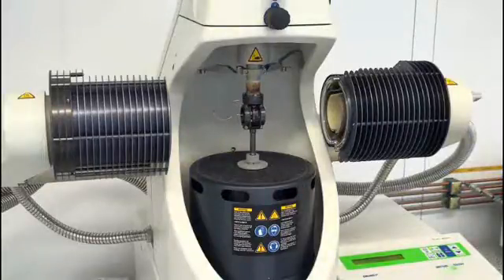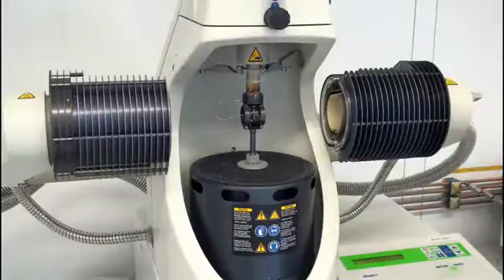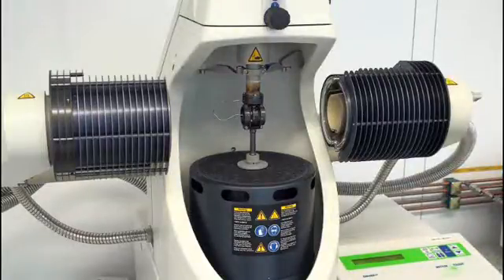But this is not all. Not only can we open the furnace to access the clamping assembly, but the whole design is dedicated to ease of use. There is a story behind this. When we developed this instrument, we talked to a lot of end users who had been working for a long time with all different kinds of DMAs.